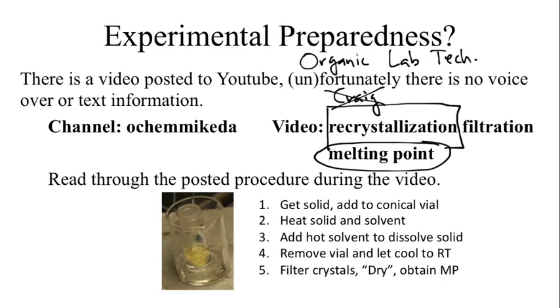If you haven't done a filtration before, if you've done Gen Chem at Mesa, they made you do a filtration system already. We have a very similar setup for our labs. You'll end up doing that again next week. But there's a video online explaining what's going on with the filtration, the different parts of it, to make sure that you understand what's happening with it. So I recommend that you watch those three videos so that you're comfortable with the actual techniques, so that when you get to the practical, you actually know how to do them.